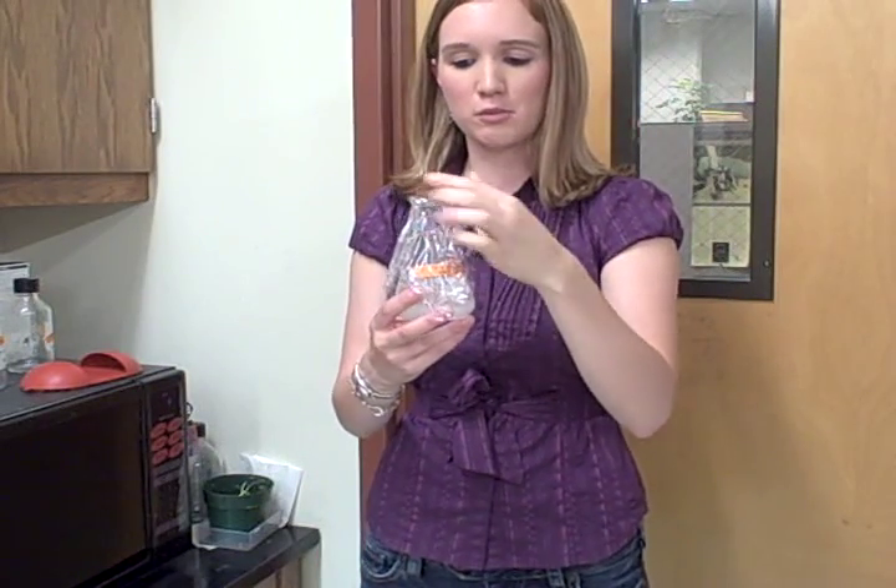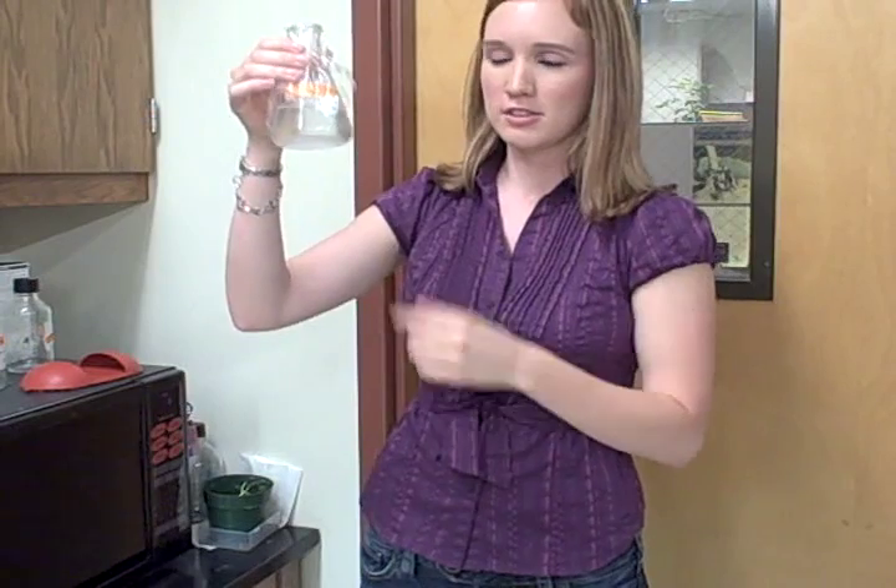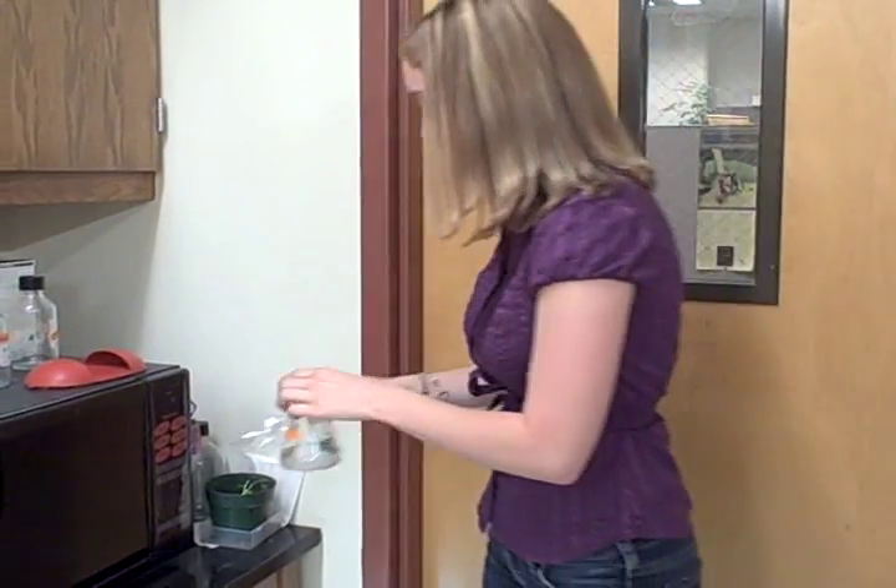Here's my 125 milliliters of Agarose solution. I made sure to cover it really well with the plastic saran wrap. As you can see, the solution isn't dissolved, so it won't dissolve until it's actually microwaved a little bit and melted down. So I'm going to go ahead and put it in the microwave.